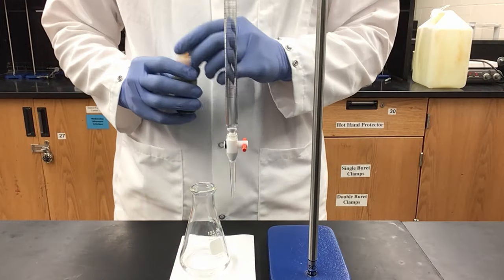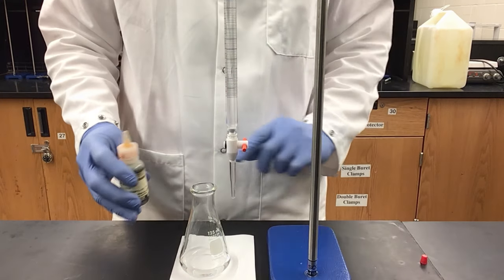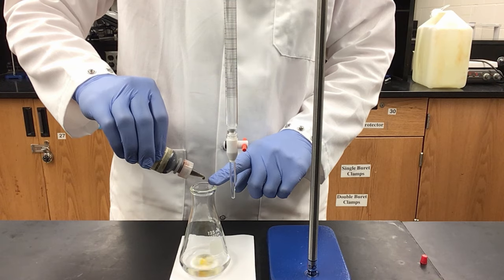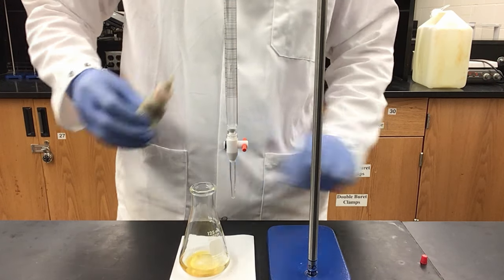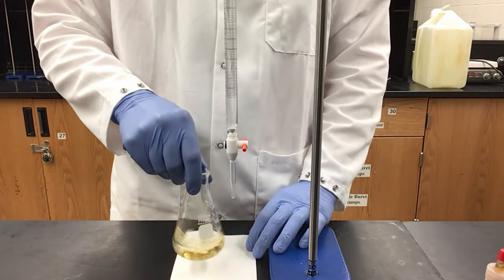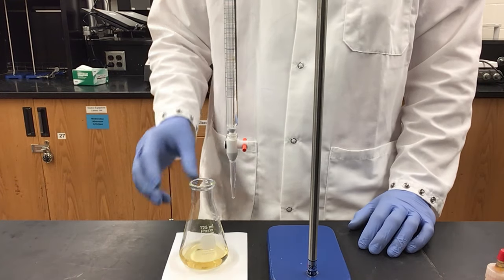Since I have now created my solution, I will take my thymol blue indicator and add 10 drops to my flask. After swirling, you can see we have a yellow solution from our indicator.